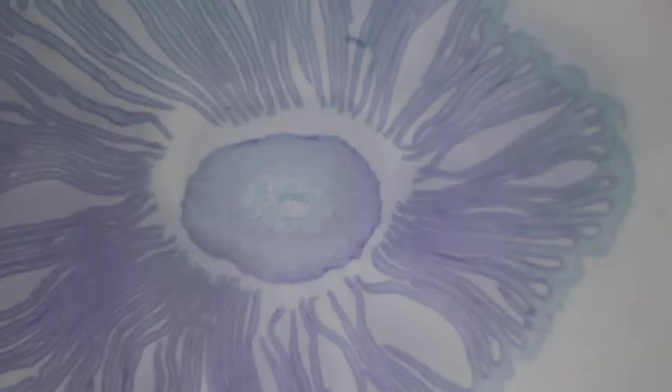We're going to get up here and focus in on these gills themselves. We're looking for the reproductive spores right on those gills, and obviously we need to move to a compound scope to be able to see that.